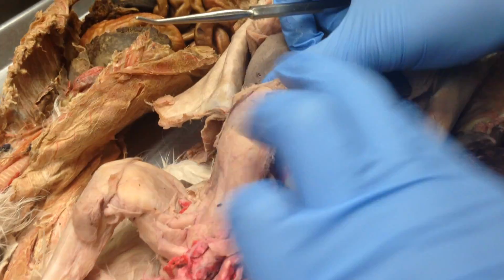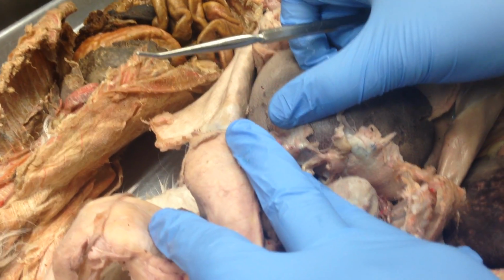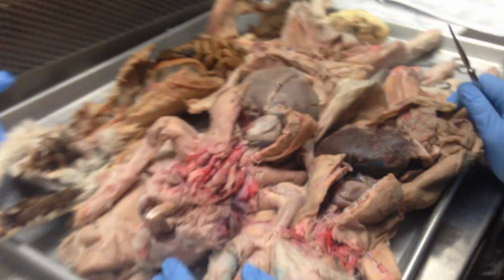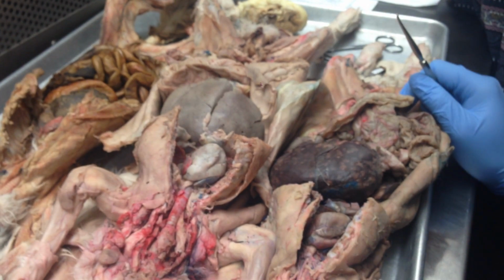It's between the heart and the liver. I mean, the lungs and the liver. I'm sorry, it separates the liver from the lungs. Okay, and then the parotid glands.